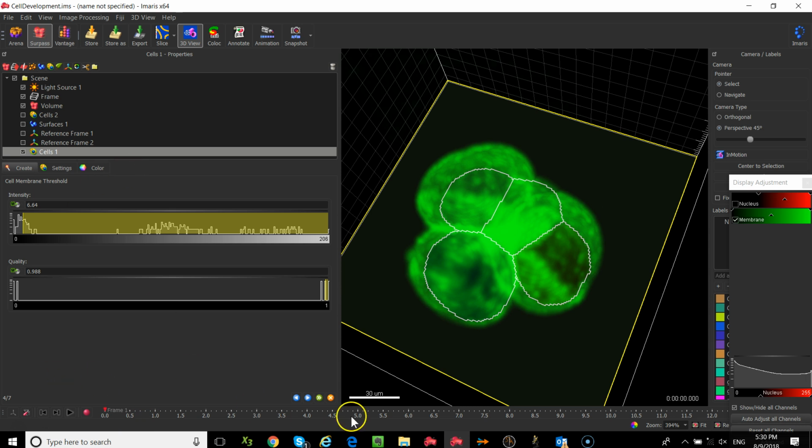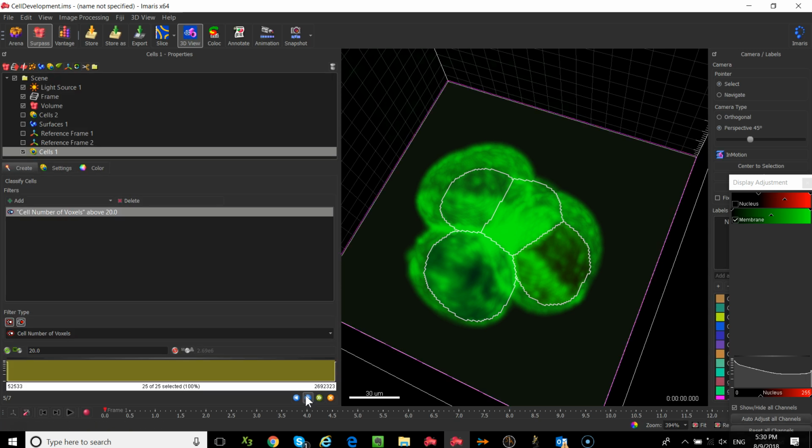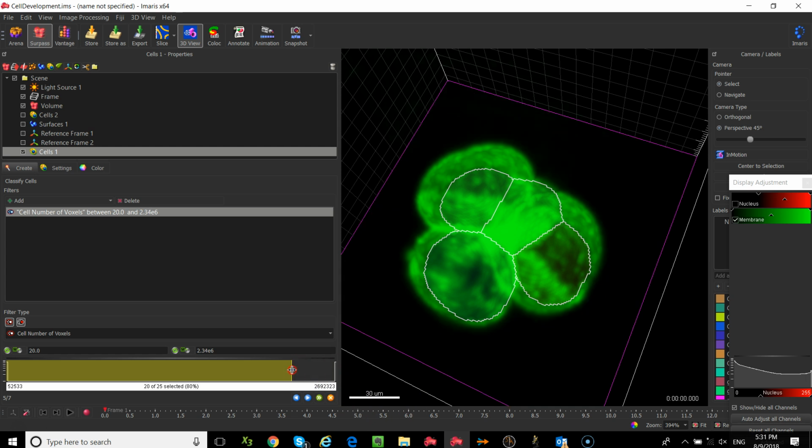Okay? So, next step. One of the things that our membrane detection does is it actually breaks your volume, your cube of data, into different parts. So even though we can see this little white outline where the cells are, that background itself is considered an object. Okay, it's a big object, one continuous object all the way around the cells. So typically you want to get rid of this background object. So I usually remove that top little peak, which is the background.